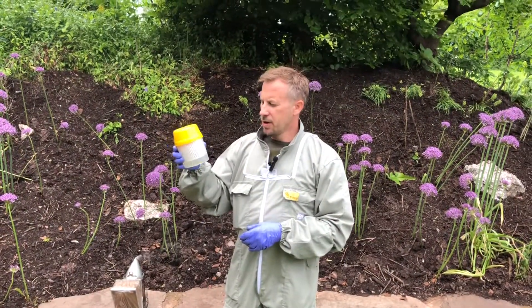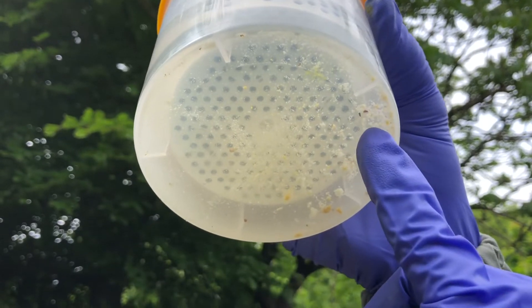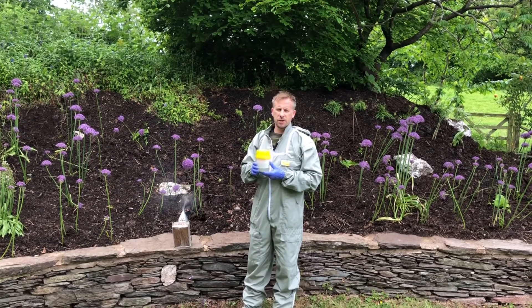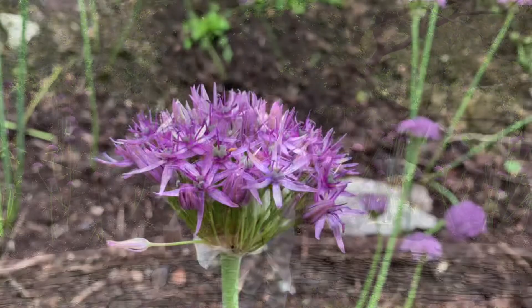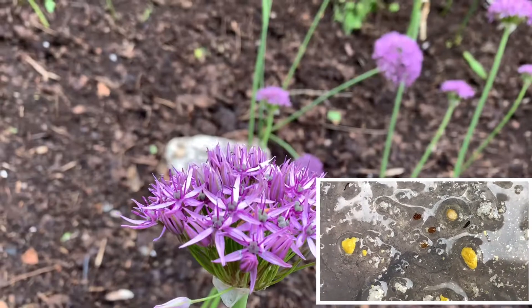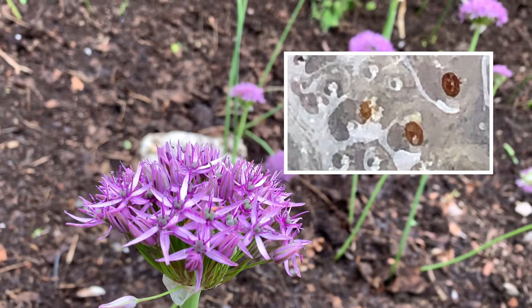We're back out in the sunshine. I've finished shaking — let's take a closer look. If the result was above three percent, which would be nine mites in this sample, I would start to consider treatment. Here we are in mid-May with a one percent infestation rate. I would expect that to climb considerably with brood production over the season, increasing the varroa load. I'd be looking at resampling later in the year and adjusting treatments accordingly.